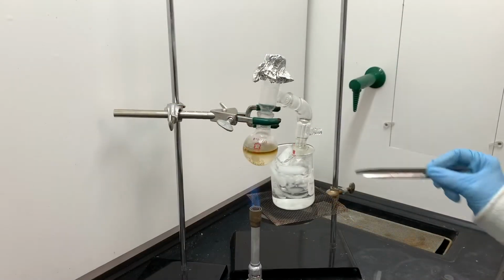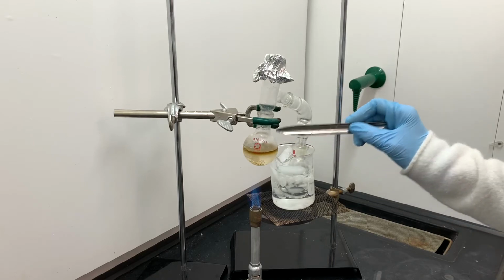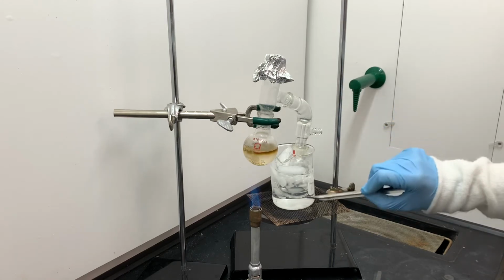So this has been reacting for about 15 minutes, and I just wanted you to get a chance to see what it looks like. Gentle boil, vapors being transferred down into that receiving flask where a little bit of product is being collected.